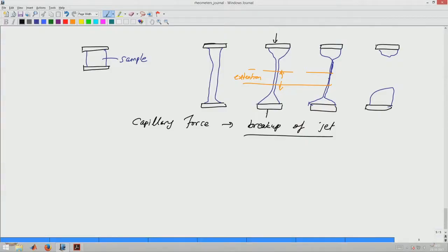You can also measure how much force is required to keep the plates at a given separation. I take the fluid between two plates, separate them, measure the force required to keep them there, and measure how the diameter is changing. So, I know the velocity of the fluid moving in extensional flow, and by analysis of these two I can back calculate an extensional viscosity. This is one measurement which is possible.